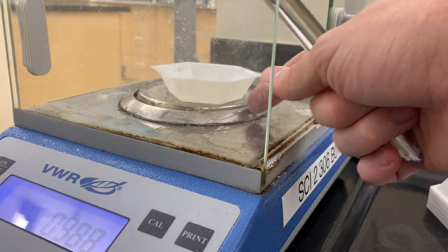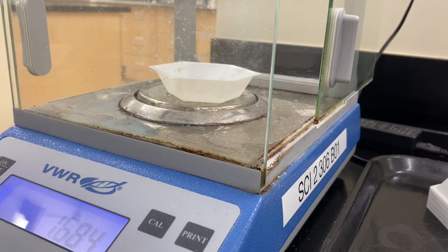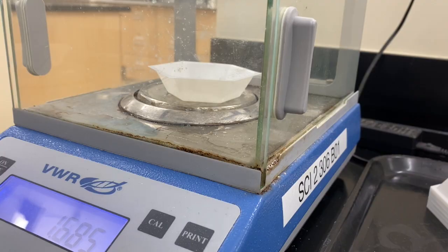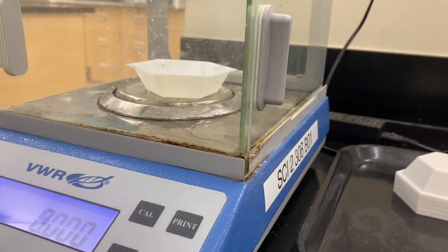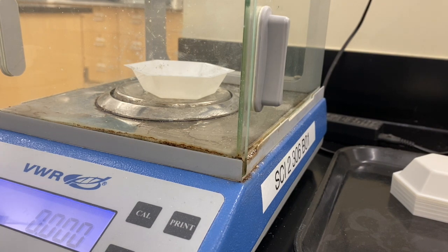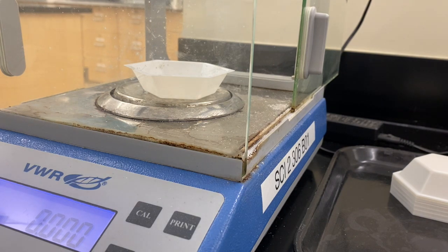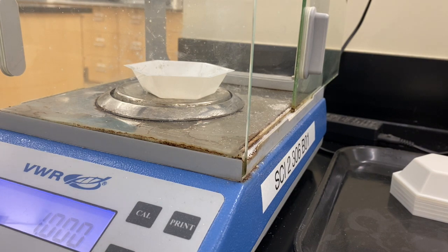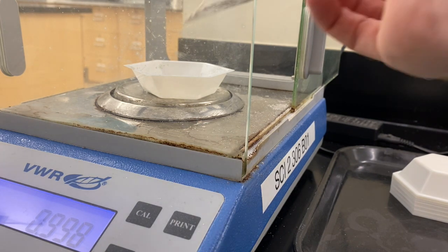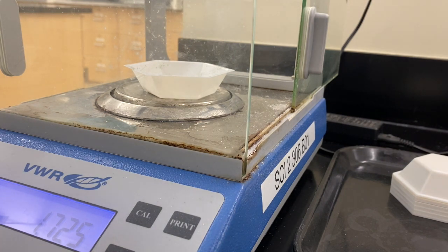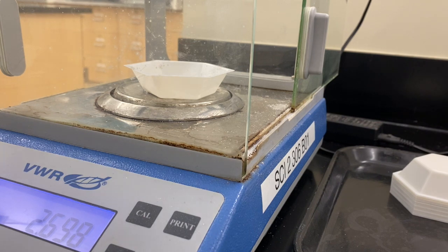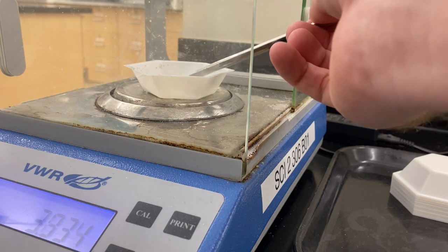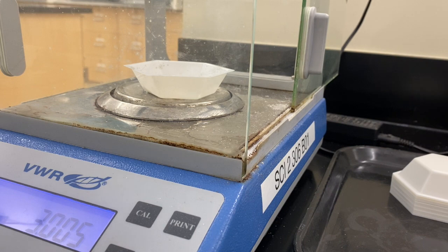We're going to add our weigh boat. We need to make sure we aren't weighing the weigh boat as well as our stuff, so we need to tare it. Hit the little T button right here and that will zero the mass. Now we're going to weigh out three grams of material. I think that's pretty good, so we're at 3.005.